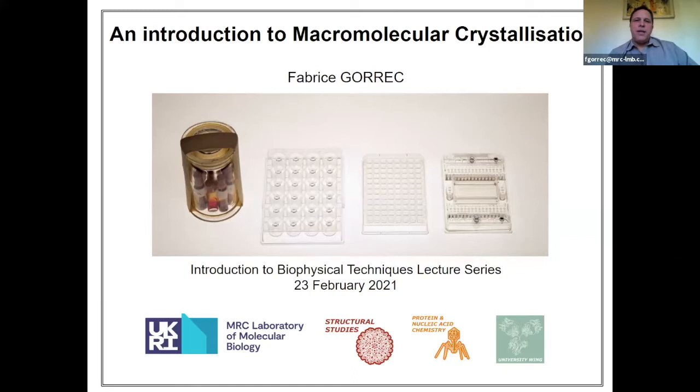On this presentation slide, the first picture represents the miniaturization of crystallization experiments over a few decades. On the left, you see a flask containing some vials from experiments of Max Perutz from, I think, the 70s. This is just to show, as a matter of scale, that the vials contain a few milliliters of precipitant. I think it's phosphate precipitant and some hemoglobin.